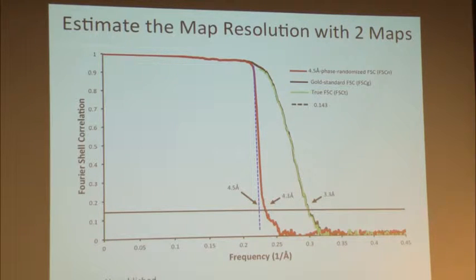Okay, that suggests to me the map I present to you was not over-refined. So that's one criterion now being adopted in the last 2 years in the field, to make sure the maps we generate are not over-refined. Okay, because image processing can be a very dangerous activity. You can just refine the noise. You can actually get something out. Okay, that's the danger. So that is why I think these types of procedures eliminate any possibility that we are over-refined and interpreting features which just come out from noise.